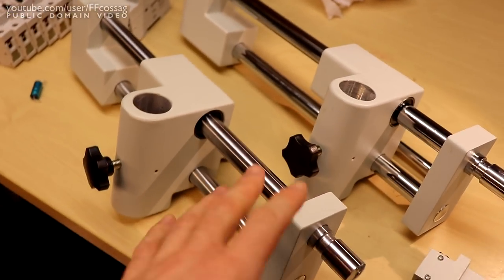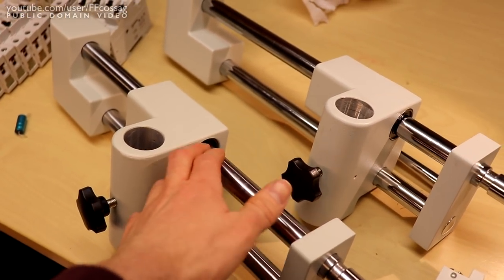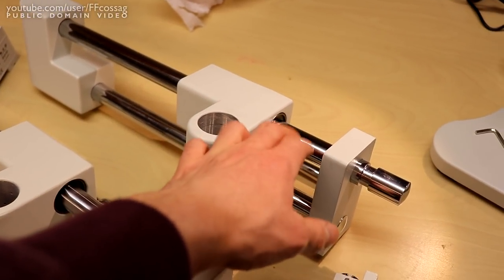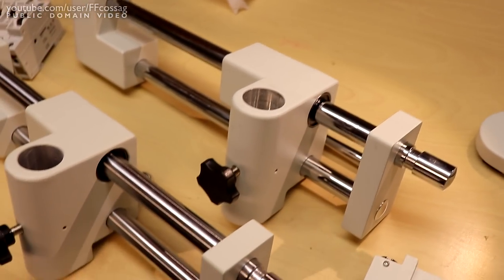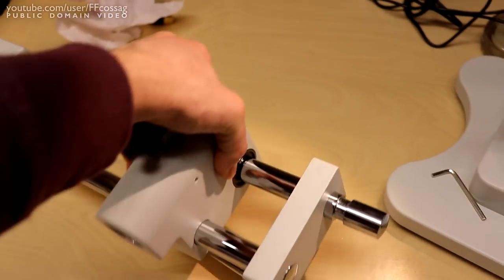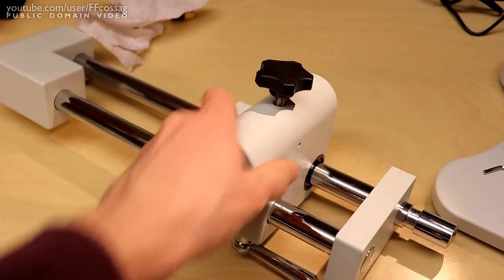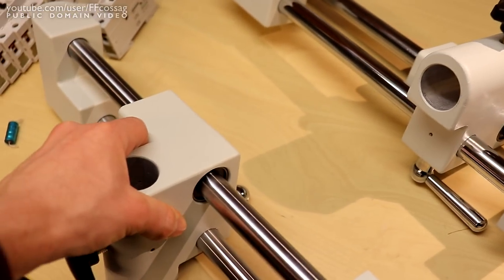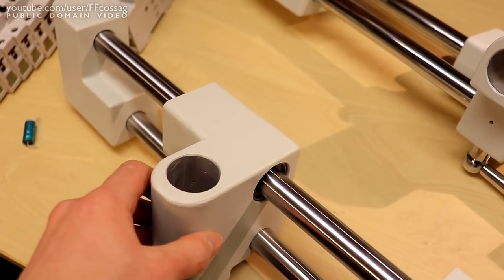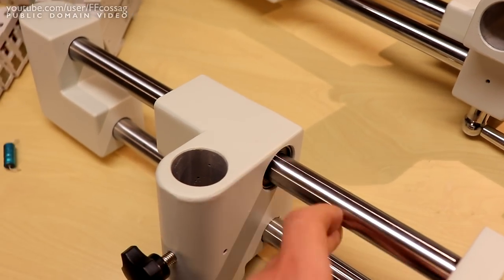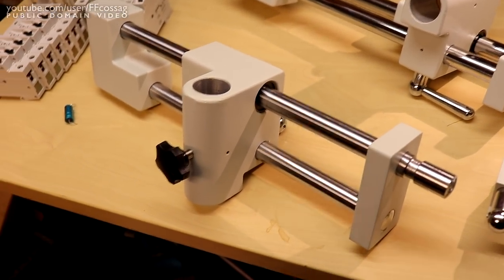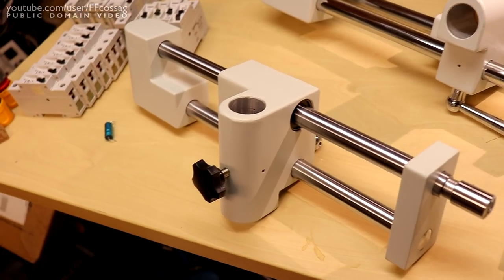The next question is, have they changed the dimension? Because another issue with these old boom arms is this rod was undersized, actually ever so slightly too small, so we get a lot of play in the bearings. I'm suspecting this one might still be undersized just looking at it, but they have changed the material and that is a big thumbs up.